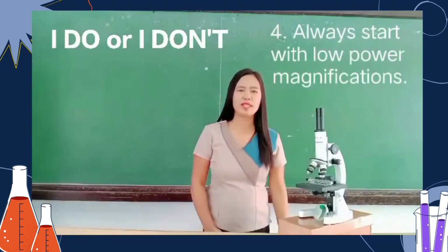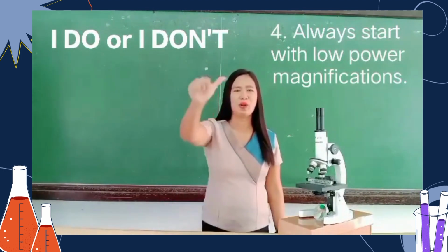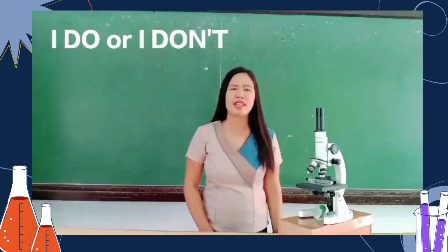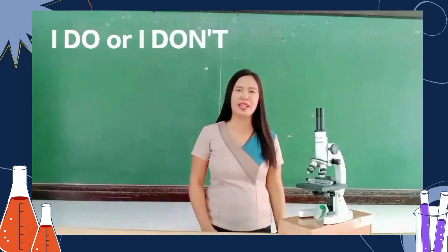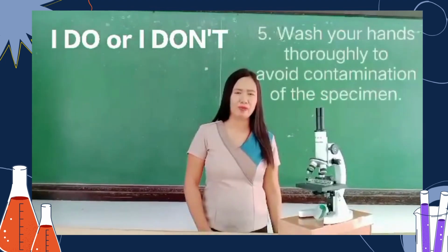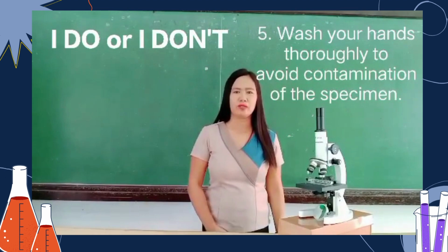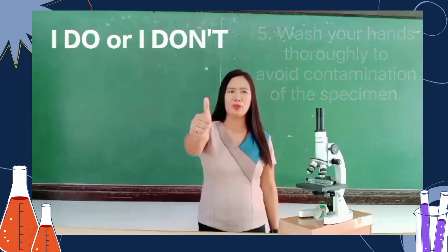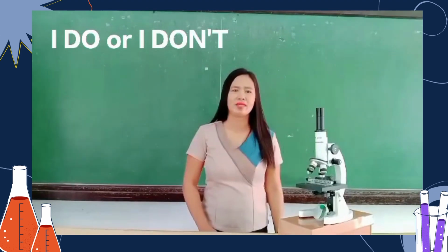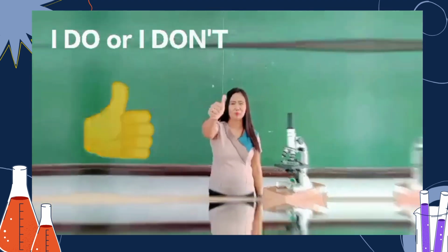Number 4. Always start with low power magnifications. I do or I don't. Yes, you are correct. The answer is I do. Number 5. Wash your hands thoroughly to avoid contamination of the specimen. I do or I don't. Yes, the answer is I do.